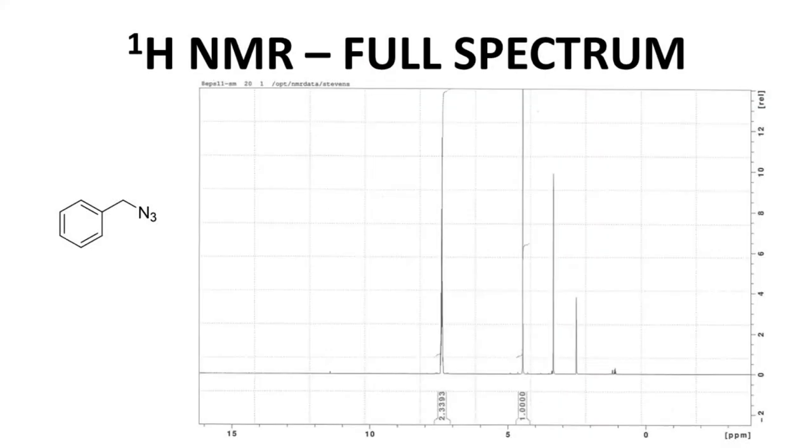Here is the full NMR spectrum. Our product is a simple molecule, and the NMR spectrum is fairly simple. In the 7-8 ppm range, we have the 5 aromatic ring hydrogens. The CH2 next to the azide has no neighbors and is a singlet around 4.45 ppm. Note that the singlet should be two hydrogens. The scale is set to one on the NMR spectrum. The integration is half of what we would expect. Therefore, the five aromatic hydrogens are also scaled to just half of what we would expect with a value around 2.5. As usual, our spectrum was attained in DMSO as the NMR solvent. The signal down at 3.5 is water in our DMSO solvent. The signal at around 2.5 ppm is the residual DMSO signal. These are not part of our molecule.